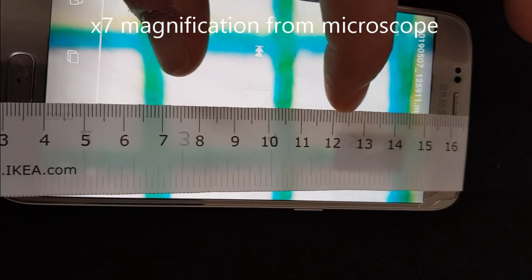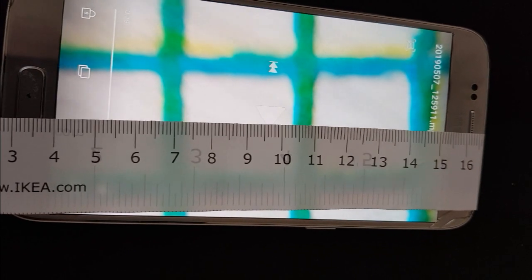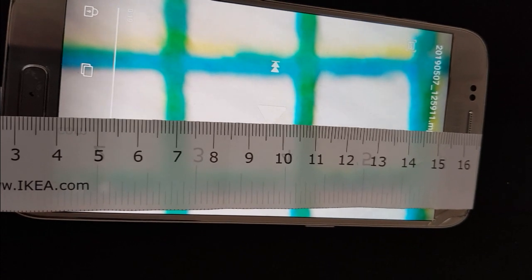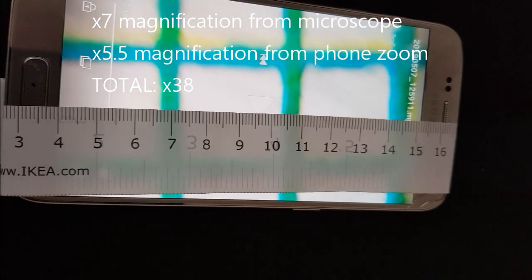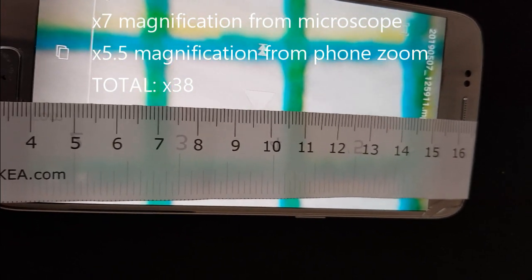If I zoom in now, one square measures about 37 to 38 millimeters — so it's not even times 40 even with the cheeky bonus zoom. I'm a bit disappointed.